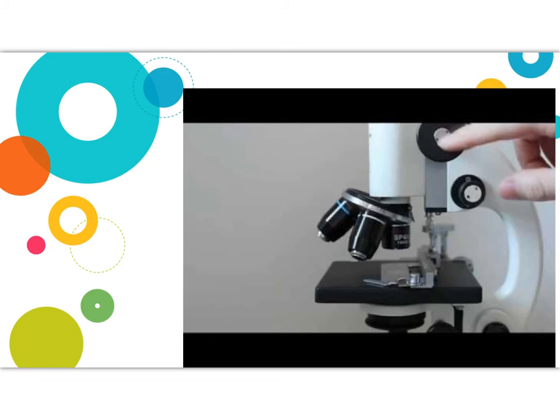This is a video on how to adjust and use a microscope. Because we aren't going to be able to use one, I think it's important just to be able to see how things would work, so that when you do return to school and you're ready for Science 24, you are prepared to use a microscope.